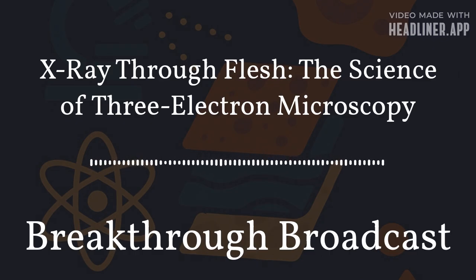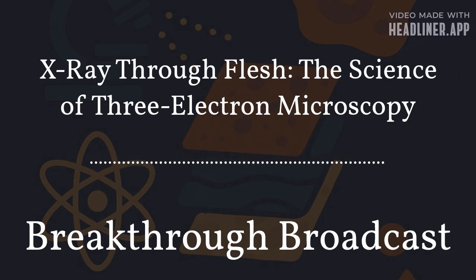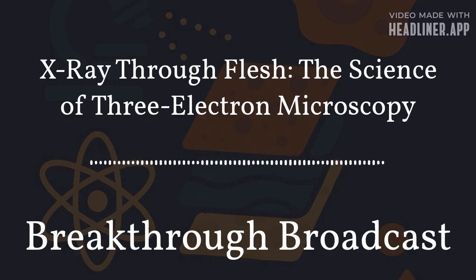Detector design is also demanding. These detectors must respond quickly and accurately to different types of electron interactions while minimizing noise. Engineers use cooling systems to reduce unwanted background signals and advanced materials that allow for fast readout speeds. All of this mechanical stability, environmental control, and detector precision has to operate perfectly and simultaneously. Without this engineering foundation, the Three-EM technique simply wouldn't function.